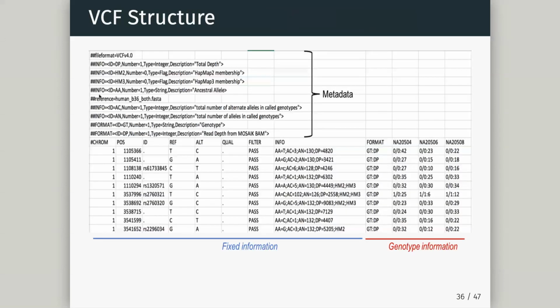So just to talk it through, we have chromosome, position. We have an ID, so known SNPs. There's great databases for known SNPs. And here we have an RS. I think that's a dbSNP identifier. You could Google that. If we went to NCBI, there's a database explaining that SNP, all the diseases associated to it, where it was found. We have the reference allele of that position and then the alternative.